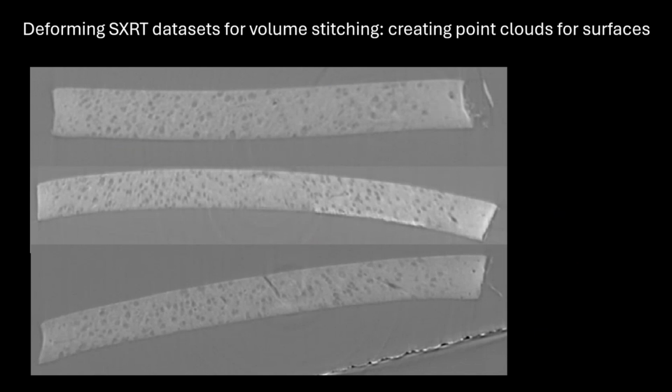Upon putting together all the projections from the X-ray imaging, it became evident that the sections are slightly bent, and that causes a problem because we cannot simply put our volumetric data together. So that's exactly what we needed in an already elaborate pipeline, just another step. Now we had to deform the X-ray data set for the subsequent non-overlapping volume stitching.